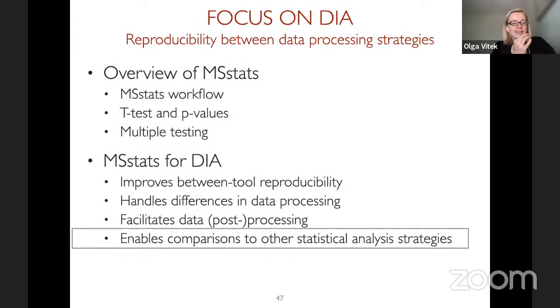And the last thing, very brief, is to talk about the utility of these converters. You can see already that because we have converters from multiple tools, it is easy for us to use standardized analysis and try different analysis strategies on different outputs, and understand what can be done statistically versus what should be improved at the tool level.